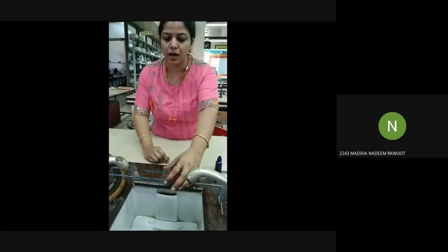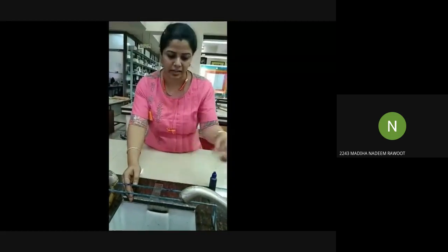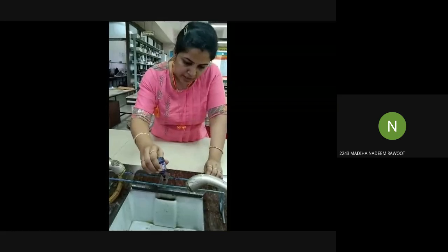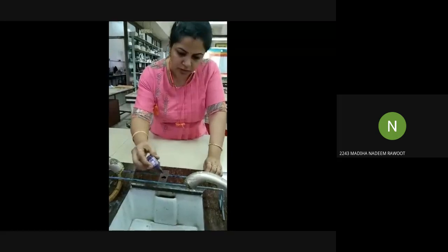We continue with monochrome staining. Our smear is ready now. You can see this is the staining stand on which we can keep our slide, so that whatever dye is there will fall into the basin and you are not staining yourself. You have to take care you don't stain your clothes or your hands. In the area where we have made the smear, we will add 2-3 drops of this stain.